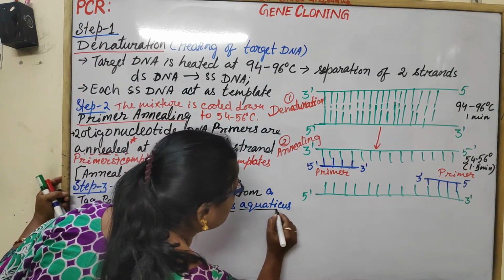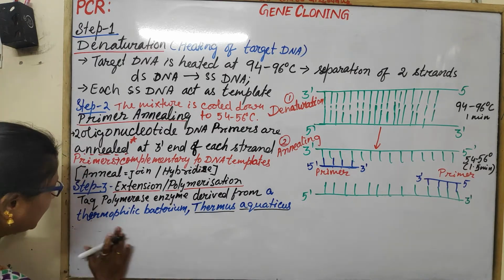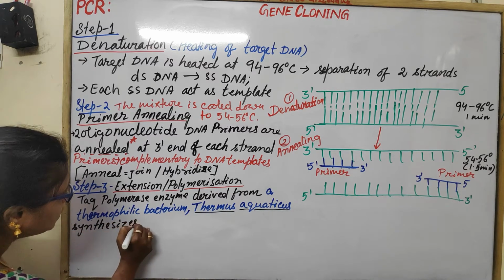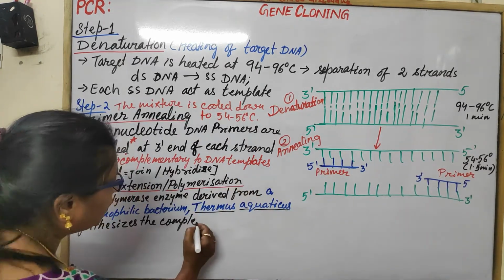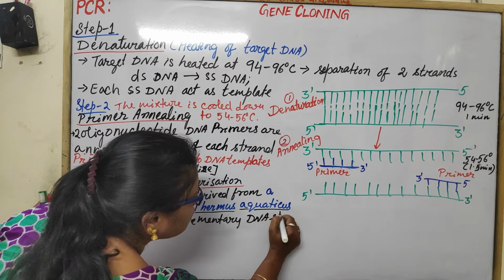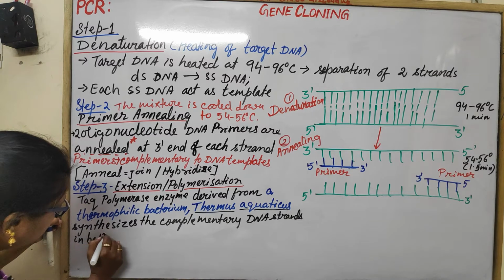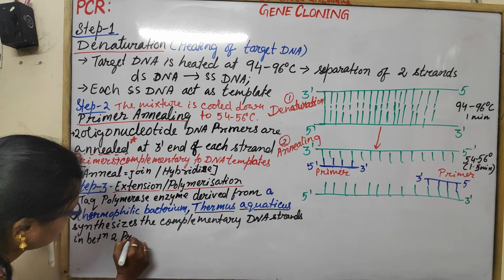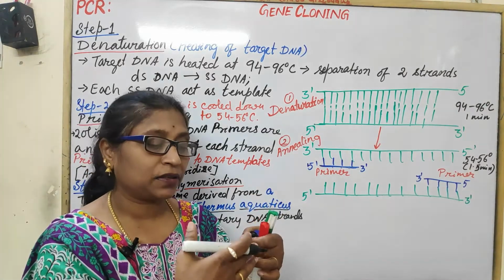It synthesizes the complementary DNA strands in between the two DNA primers, using these as the template. That means the two primers are extending towards each other.